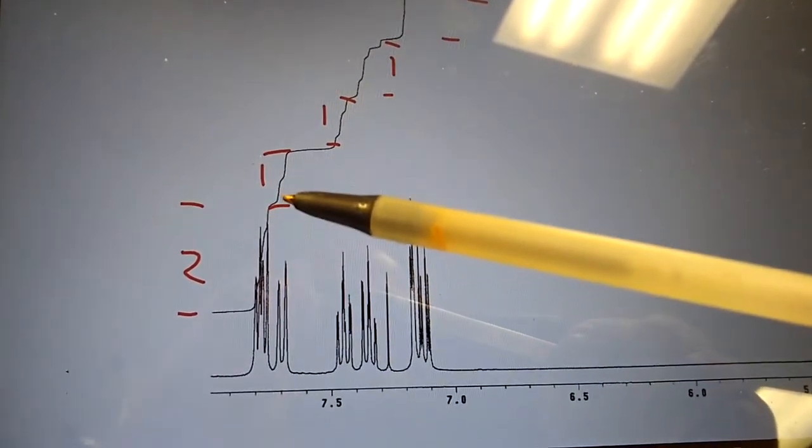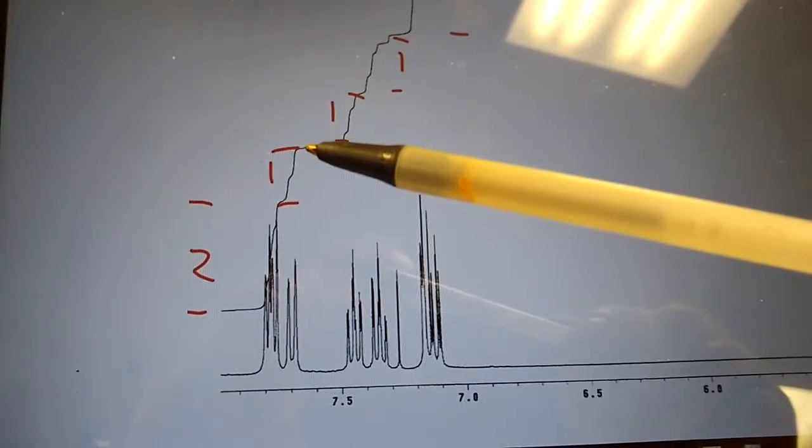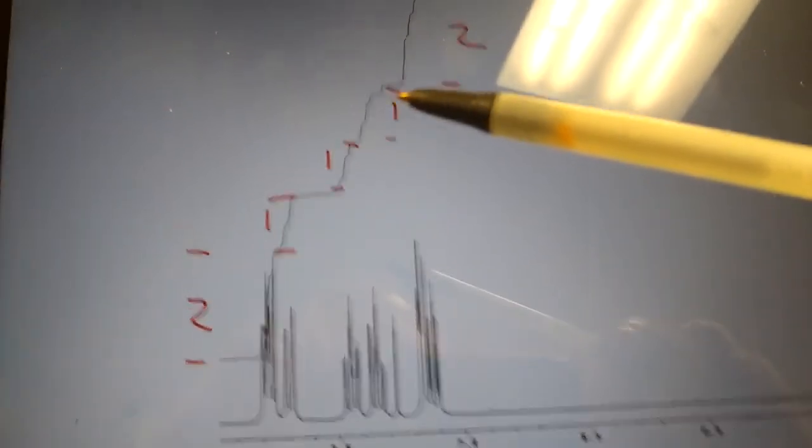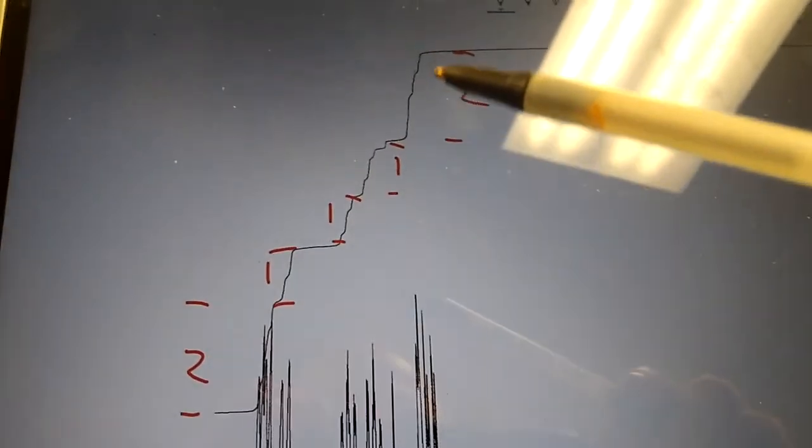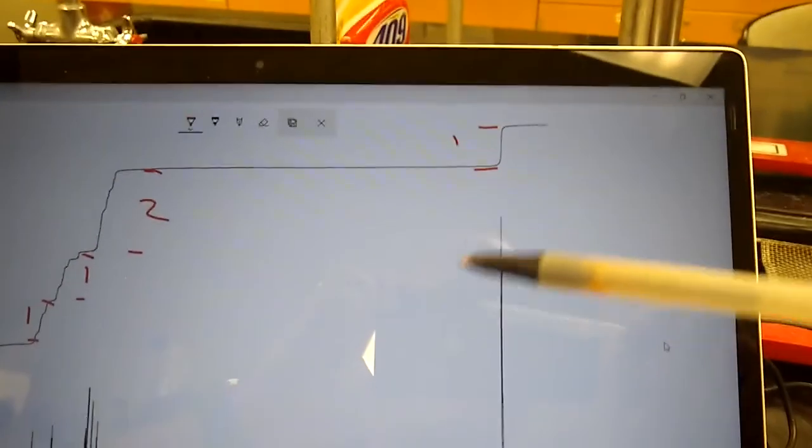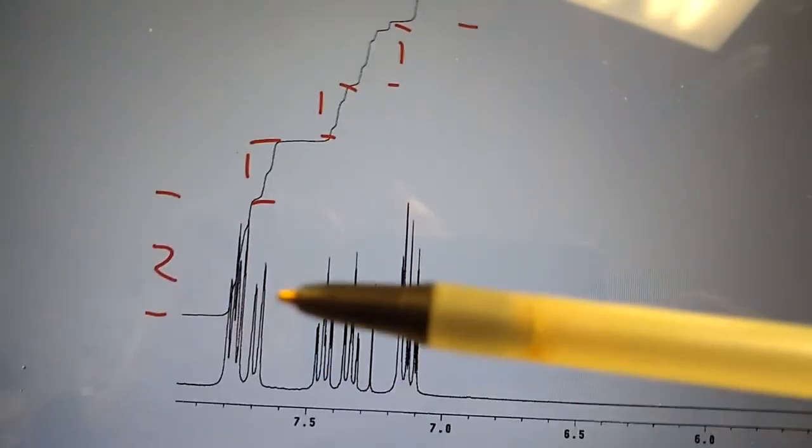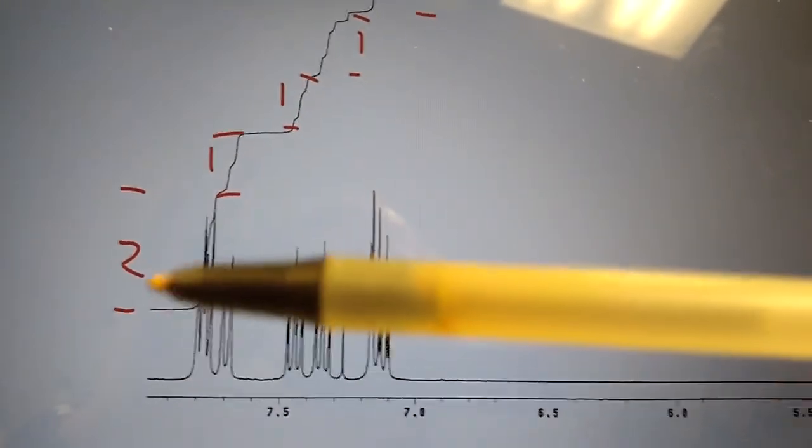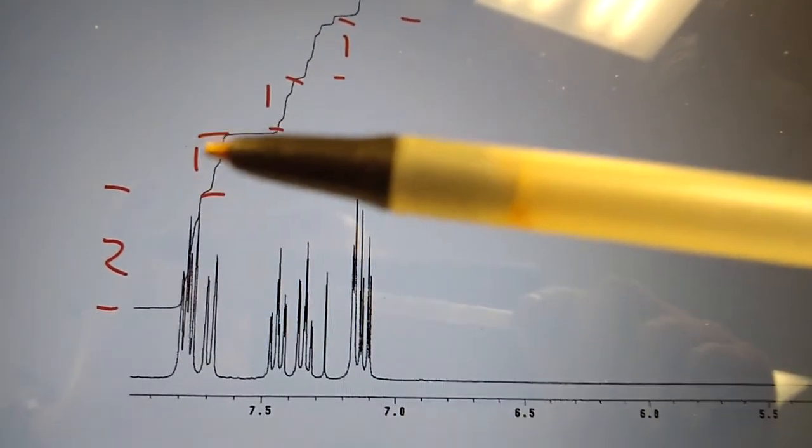You do that for each little stair step, and you've got one way down here that you can't see very well. If you compare the measurements for each stair step, you'll see that this one and this one are double the distance of these other ones.